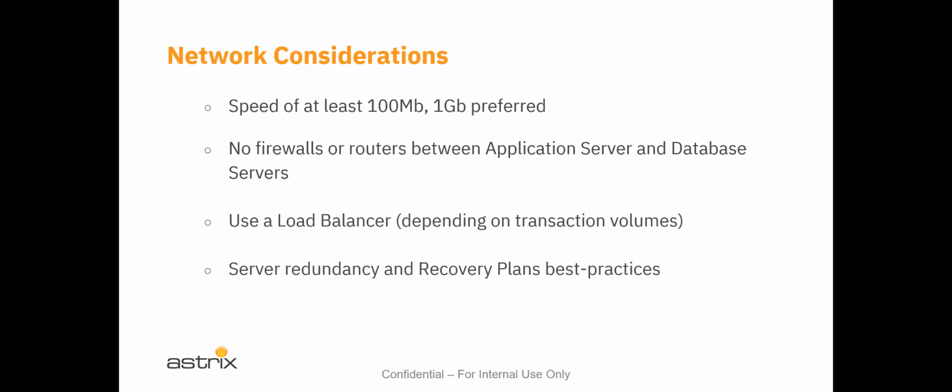Then there's also the consideration for server redundancy, backup plans, any number of failover situations, and that's just for the application server. We also want to talk about redundancy and backup plans on the database side. So you might have RAIDs, or arrays of independent drives, that are handling the possibility of a failover in an environment where you can't have a failure of any sort. That's all handled typically by DBAs and by the system administrators for the client, but you need to know about them so that you can speak their language and lingo if there are issues related to the database.